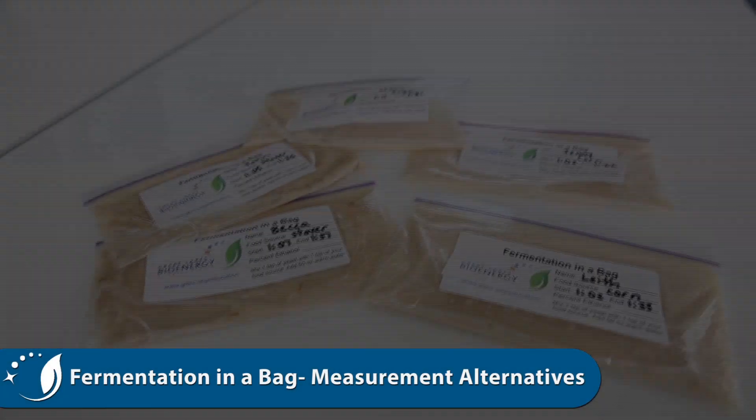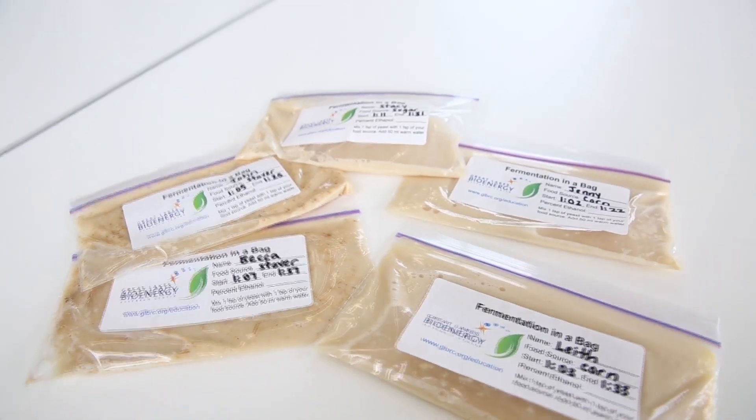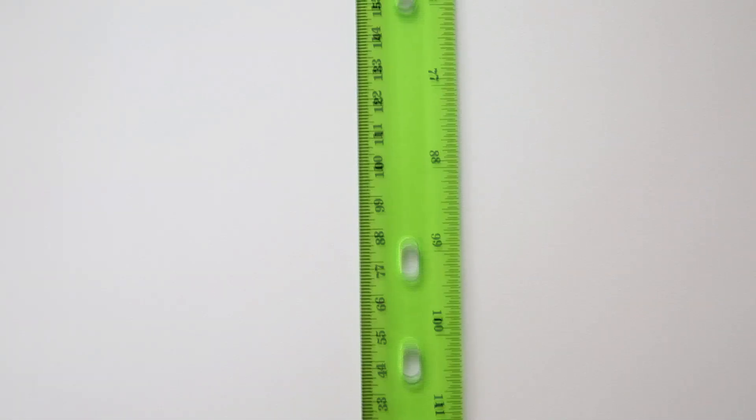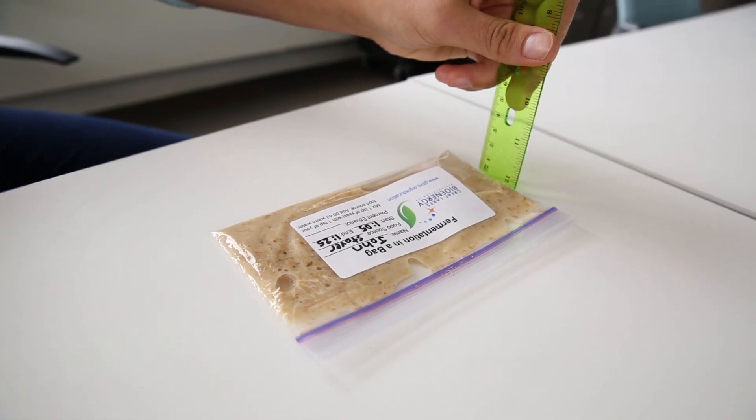If your classroom doesn't have an ethanol probe, here are some alternatives for measuring the differences in fermentation rates. The simplest option is to use a ruler to measure how much your bag inflates. This is an indication of how much carbon dioxide was produced during fermentation.